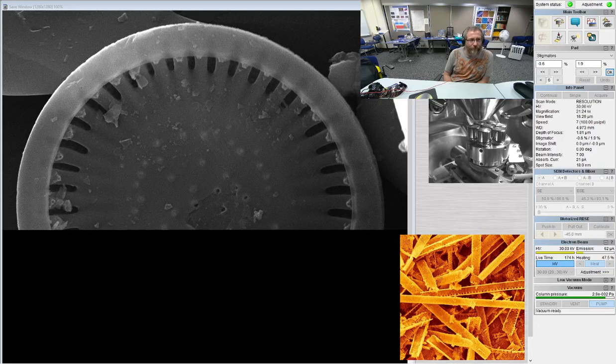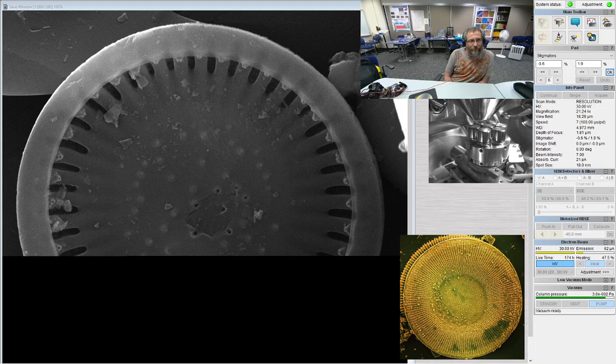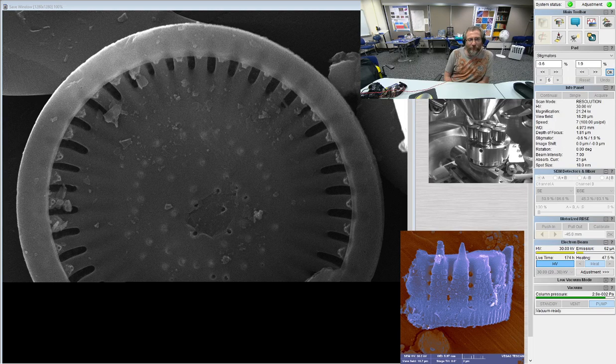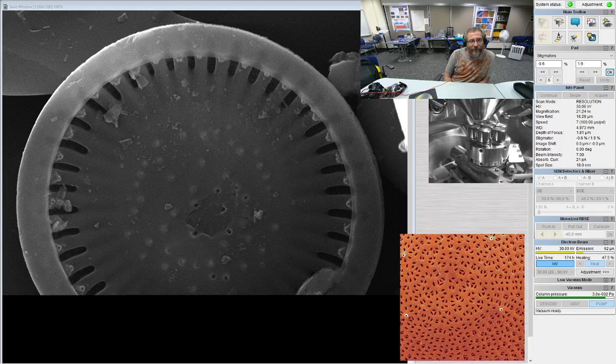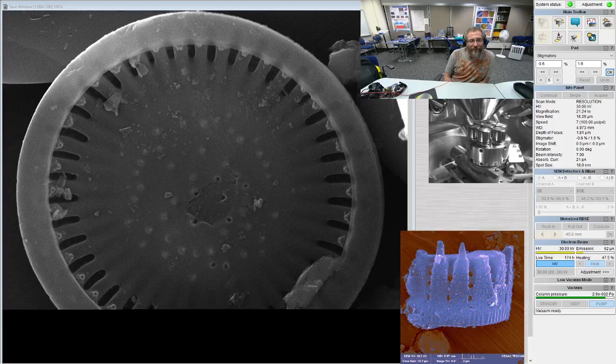Yeah. But in the modern era, you're allowed to put holes here. If you put a rimaportula over here, you're allowed to put a fultiportula over there. But then you go back in time and things don't follow the rules anymore. They made the rules for the genus names based on modern material, and then oopsie, forgot to look at the fossil material to see what it was looking like. And I think they actually looked at the fossil material. They just didn't realize they would orphan so many things. So there's a lot of orphaning that went on.